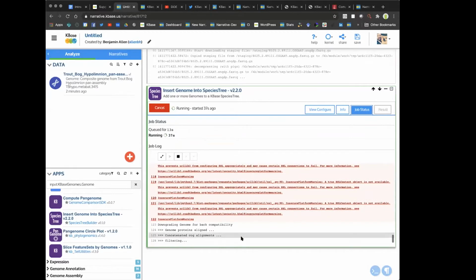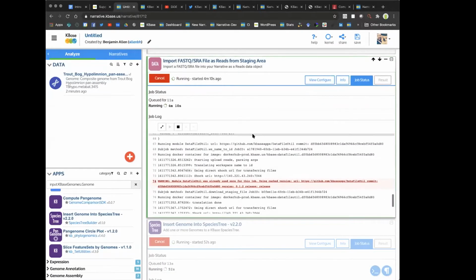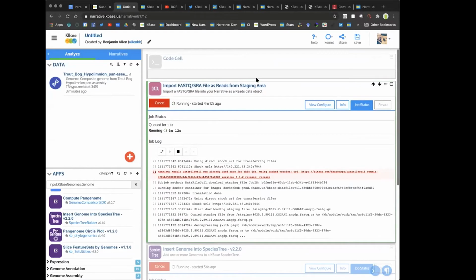We have built the container for these various apps and data to operate together in this environment. So all these things are running right now, and we'll come back to them. But just to show you the last part of the narrative interface here, the top section, you'll see the toolbar. And so I'll just go from left to right. You see the hamburger menu. If I want to go back or see some information about what's going on, I can use that.